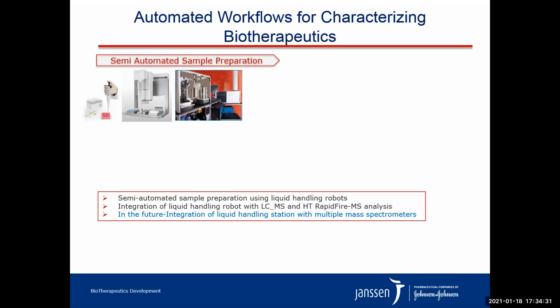Our analysis starts with molecules that are usually fully purified from cell culture. The current process is semi-automated, and liquid handling robots are used mostly for digestion and sample introduction. Standard LC-MS workflows as well as high-throughput RapidFire MS are used as analytical instrumentation. We are also integrating sample preparation and mass spec analysis, where robotics will interface with sample preparation and mass spec analysis in the near future.